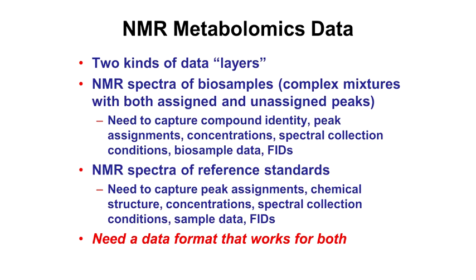So we need to capture those, and then we also need to capture those reference standards, the pure compounds, the things that are in the BMRB or HMDB. These are the ones that allow us to identify what's there and to quantify. And so in that regard, we have to have data formats that can work for both.